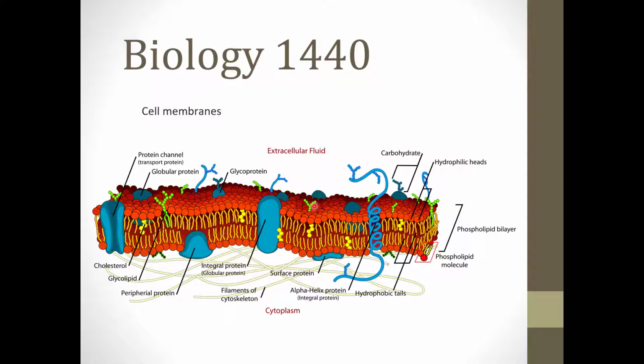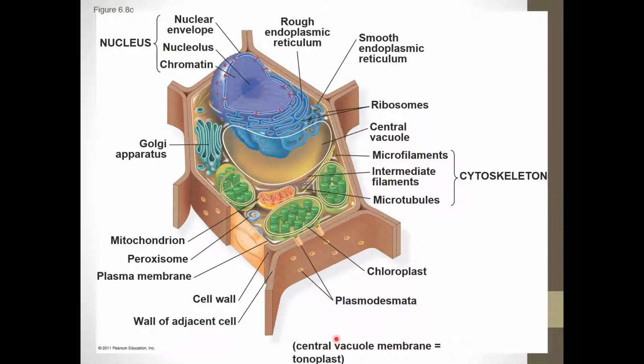So if we can measure how we can damage it in a beet, we might be able to better understand what damages cell membranes in other contexts. And beets have a red juice inside called beta-cyanin that leaks out when you damage their membranes, making their damage easy to detect, which is why it's a great model for studying cell membrane damage.